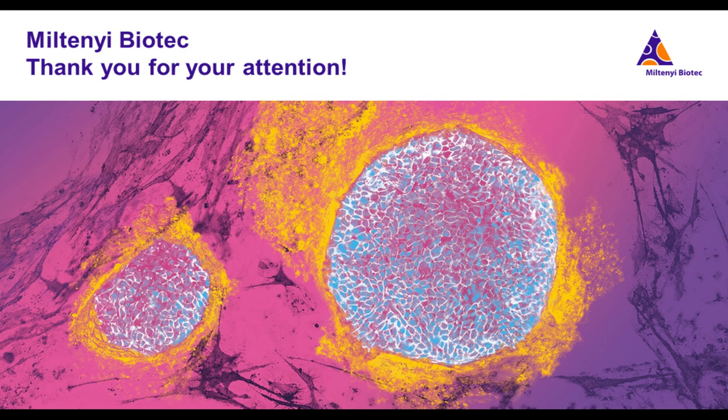And these fluorochromes would have to be bleachable, because this is one of our erase mechanisms we are using, and therefore this is something you have to obtain. But if you have this, it is not a problem.